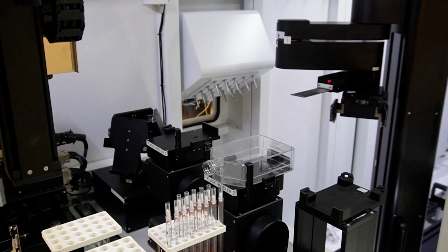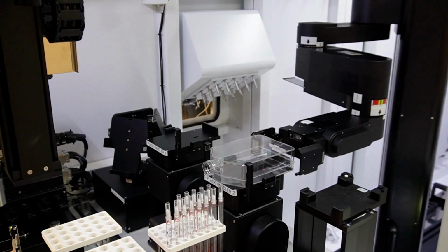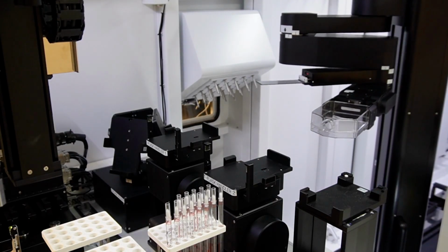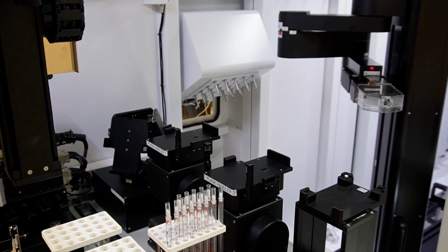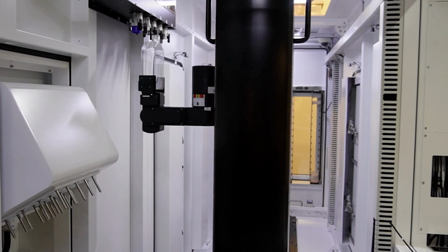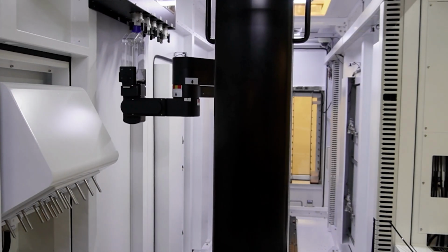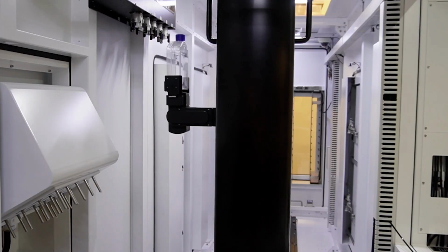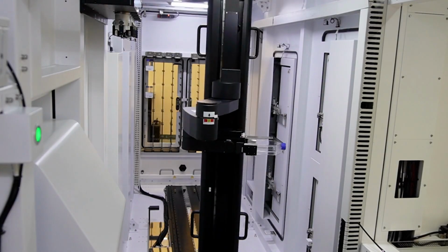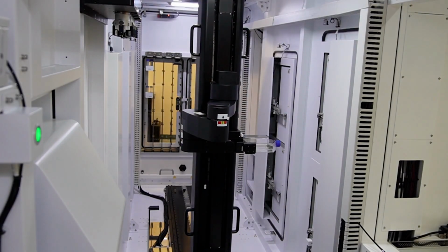Following that, if there's any additional stuff that can be done, right now this is just showing the Scara arm. Once those tasks are completed, it will pick up the flask. It will take it back so it can recap the flask. And then following that process, it will take the flask and put it back into the incubator so that the cells can grow and incubate until it is needed to be pulled out again at a later time for continuing passaging or cell banking or moving along the process.